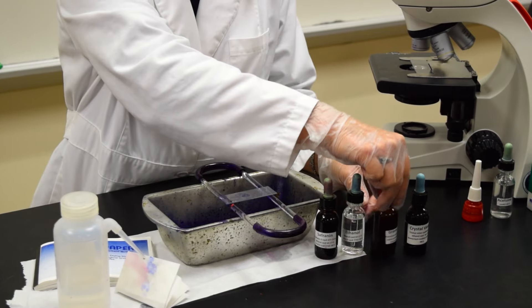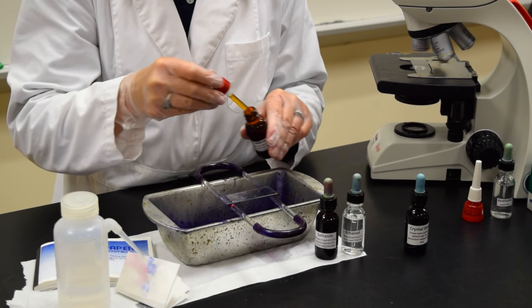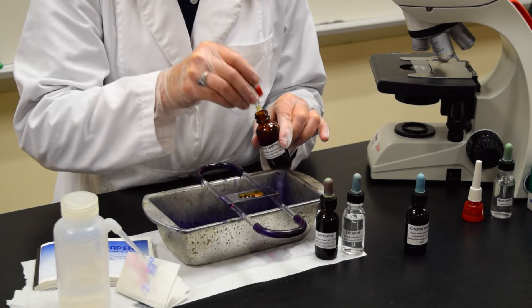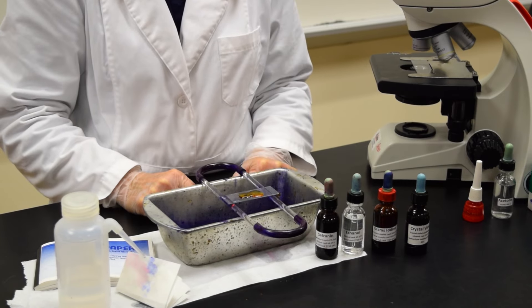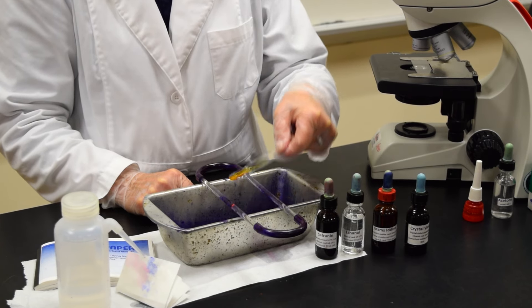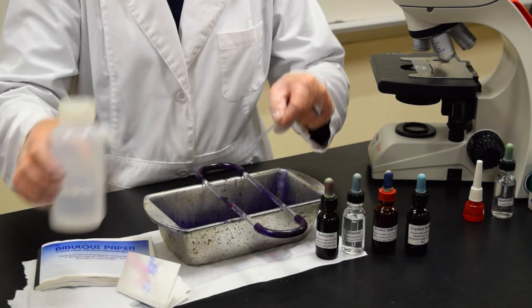The second reagent is your gram's iodine. You're going to allow the gram's iodine to remain on the slide for 60 seconds. After 60 seconds, tilt the slide and rinse with the deionized water.